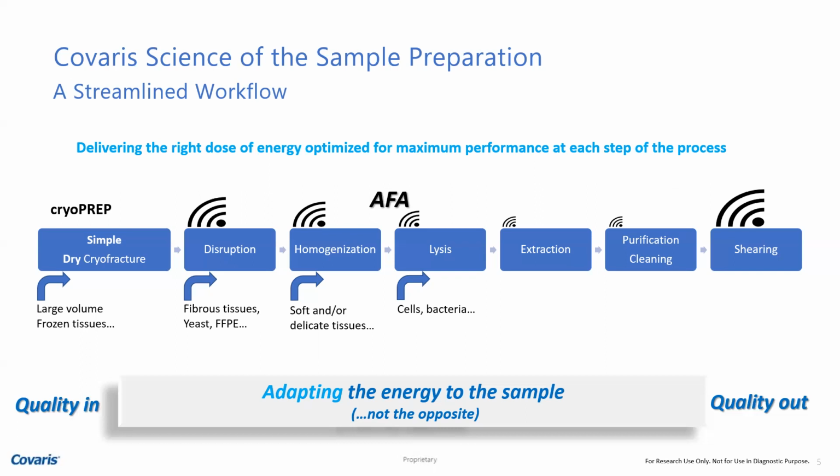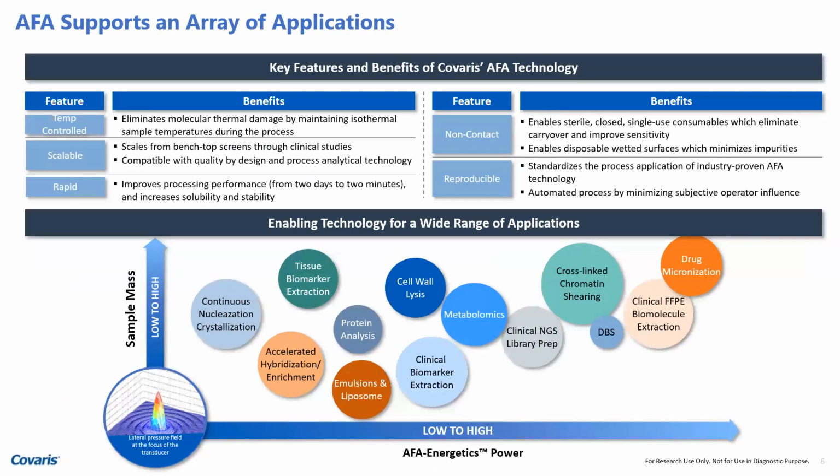It works with much less power. For homogenization, you don't need a lot of power. So those are the times where you would need different power settings, and that's where you actually have the ability to customize. And there are several other customization points that I will address.